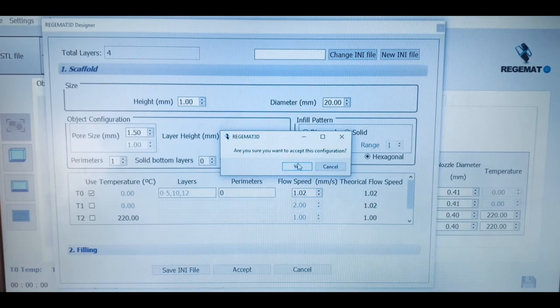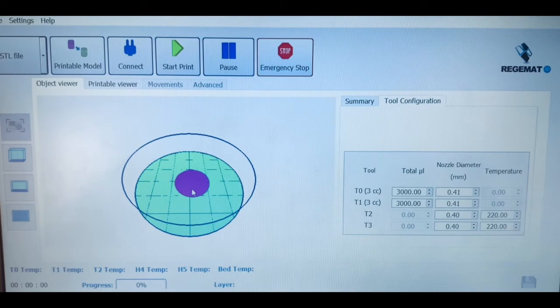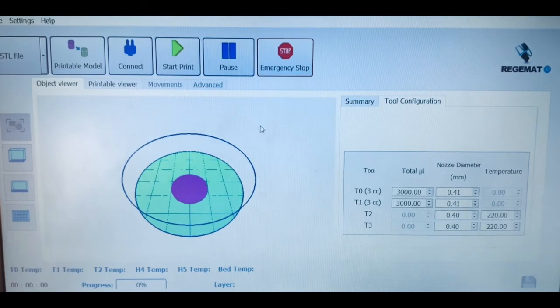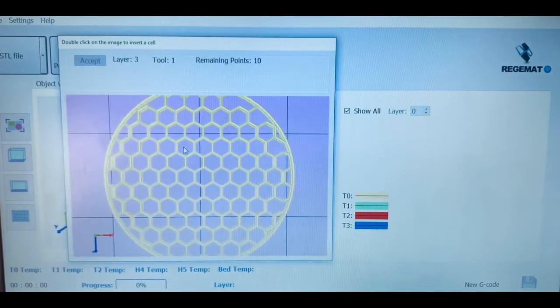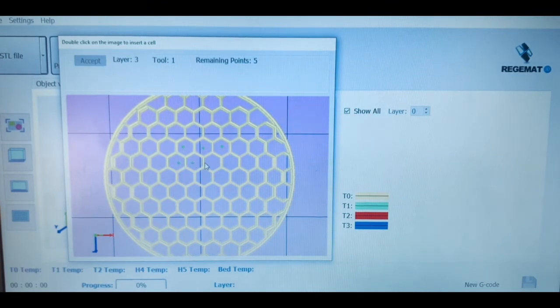It is important to mention that our systems work with different bioprinting technologies, including fused deposit modeling, injection pore filling, as we are seeing in the video, or even injection volume filling.